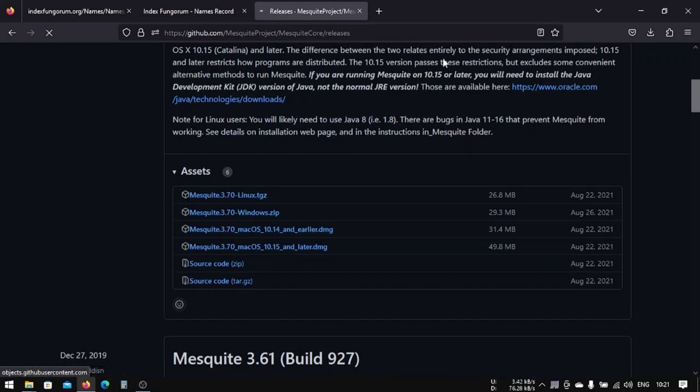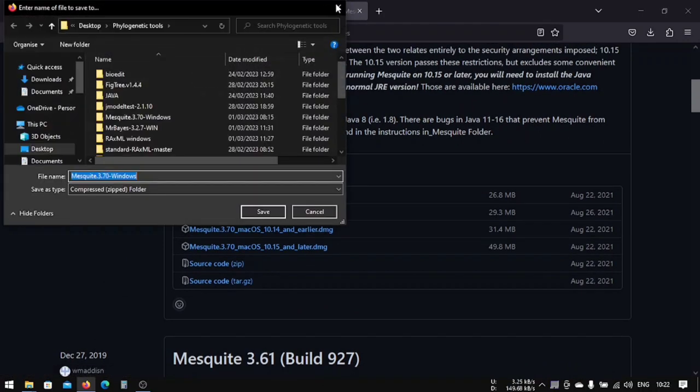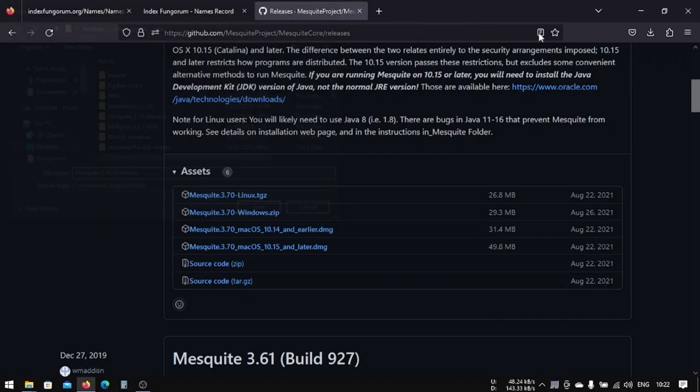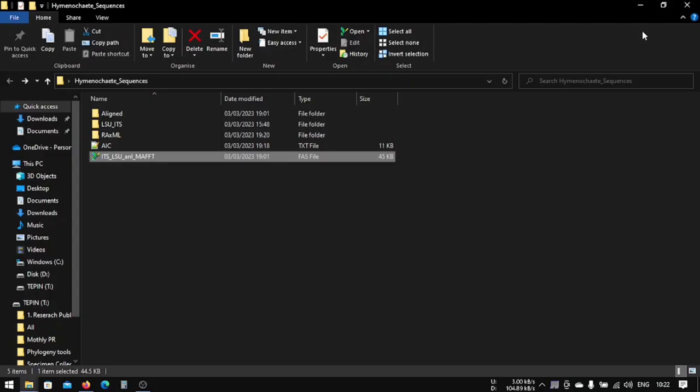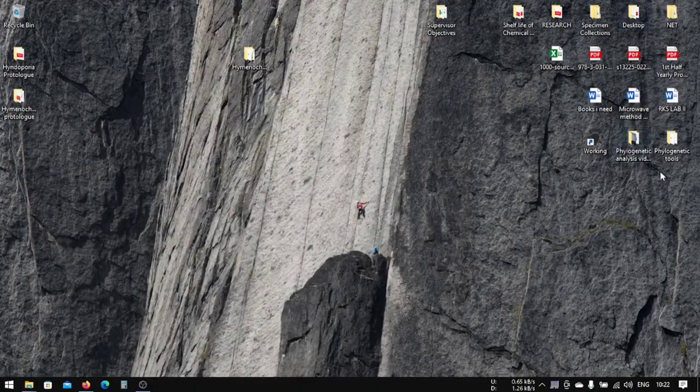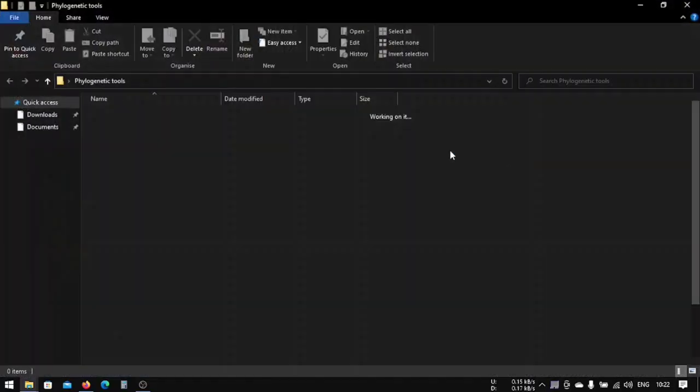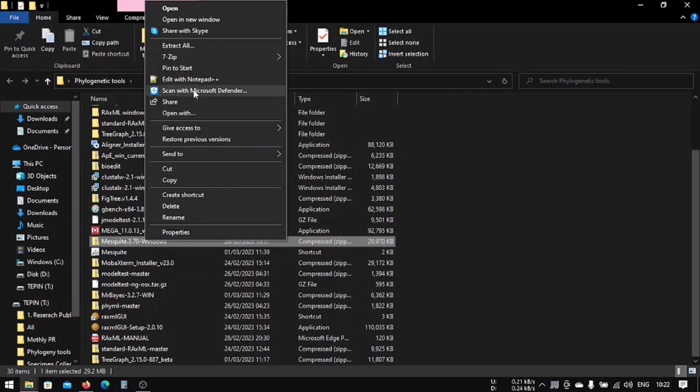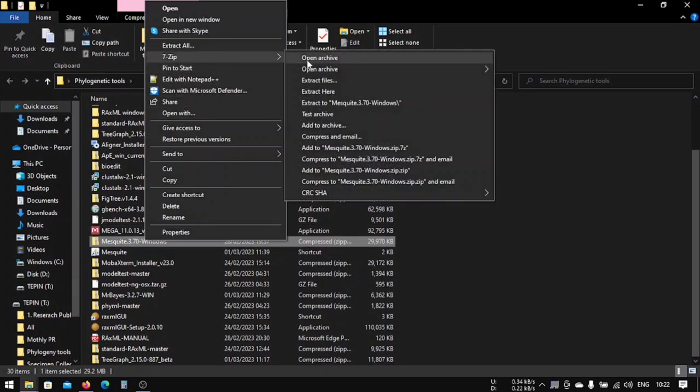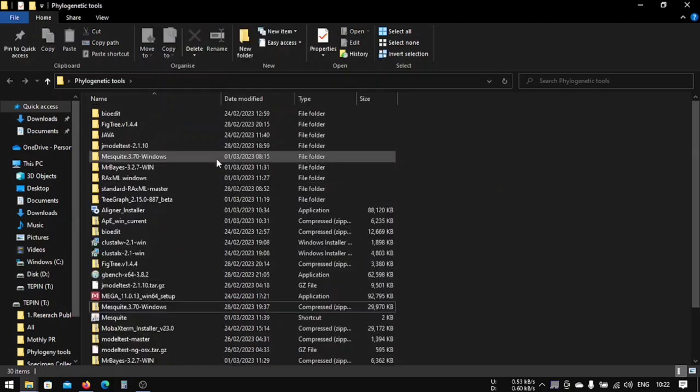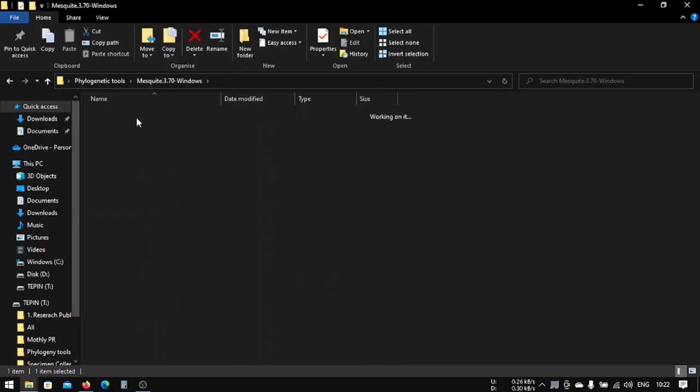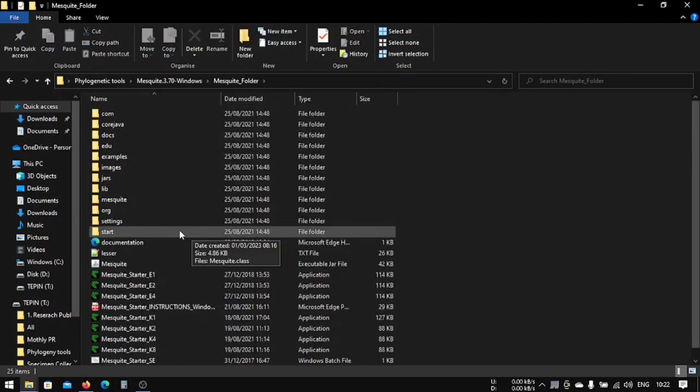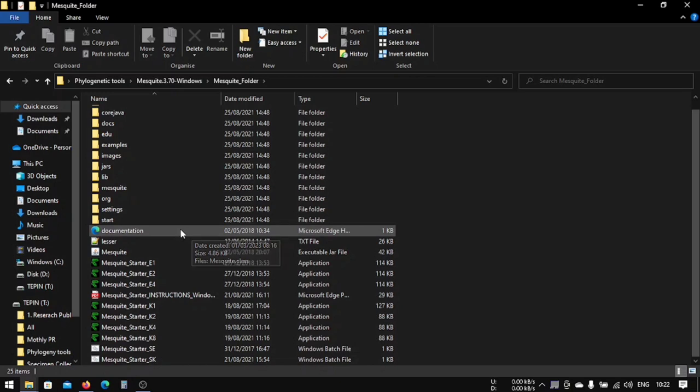I have already downloaded this, so I won't be downloading. I'll just show you where I have downloaded. After downloading, you will get something like this. You have to uncompress it using your decompressor, and then you will get something like this.